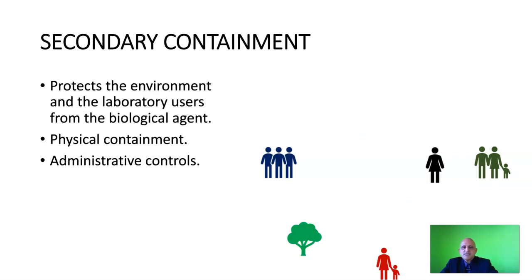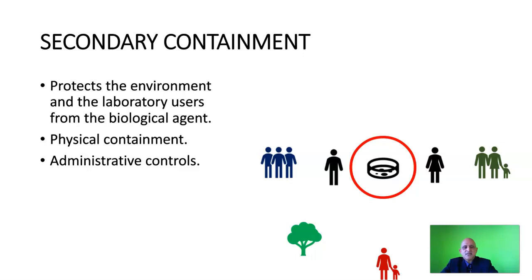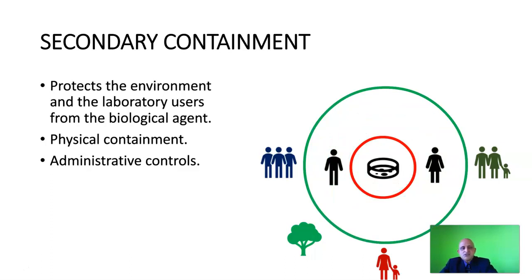Secondary containment protects the environment and the laboratory users from the biological agent. It can be in the form of physical containment or administrative controls. We have our biological agent in the laboratory, our laboratory users, and the first level of containment — shown in a red circle — protecting laboratory users from the biological agent. Secondary containment then protects the environment in the vicinity of the laboratory from this biological agent, and can be in the form of the facility design or other measures, which we will discuss in the lecture on facility design.